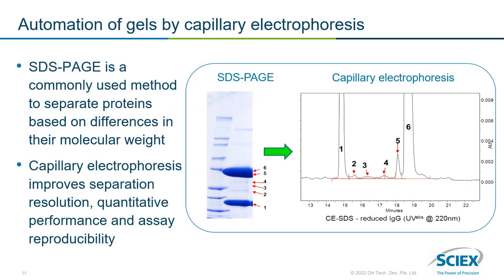Prior to laboratories adopting capillary electrophoresis SDS applications, the majority of protein sizing and purity information was revealed through SDS-PAGE slab gels. The purpose of these slab gels was to show protein purity and heterogeneity by separating proteins based on their size with electrophoresis. This process, however, was labor-intensive and struggled with poor reproducibility and resolution. The CE-SDS application is a replacement for slab gel analysis. This approach is now the industry standard for quantitation of impurities in monoclonal antibodies, for example.